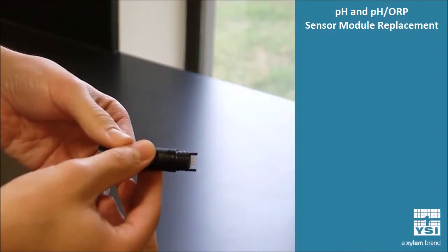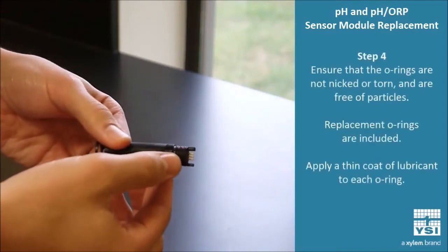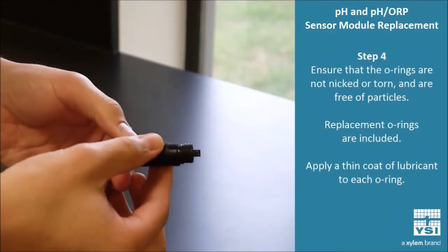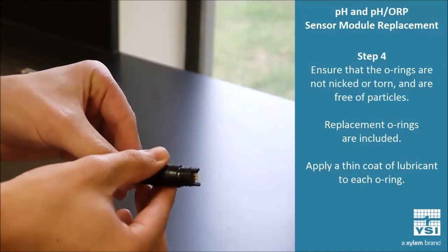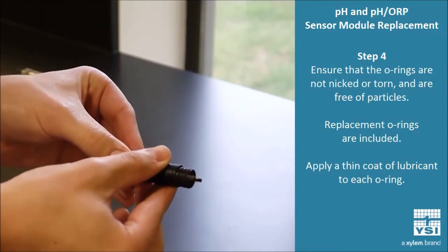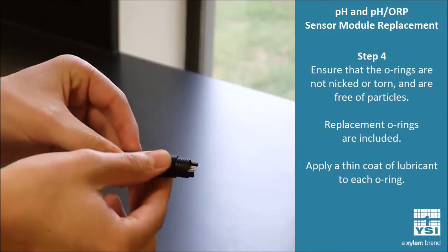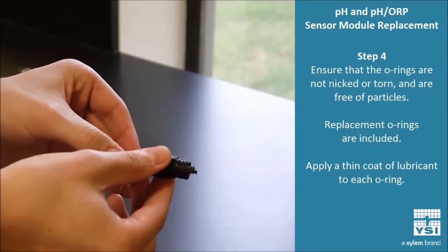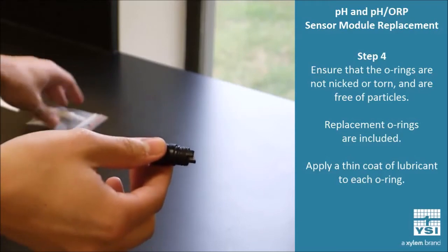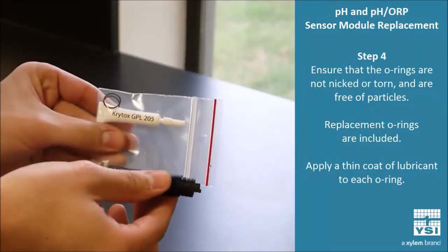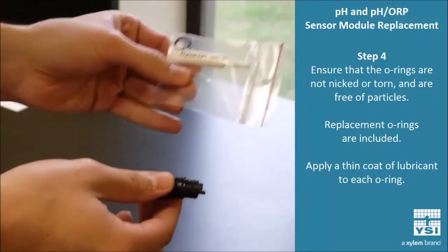So step four is to inspect these O-rings at the bottom. You want to make sure that there's no nicks, no issues with that guide, no contaminants, no particles, anything like that. So just keep it nice and clean. And in addition, you want to have a nice light coat of Krytox grease placed right around those O-rings.